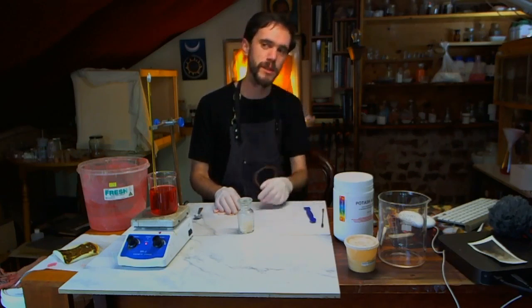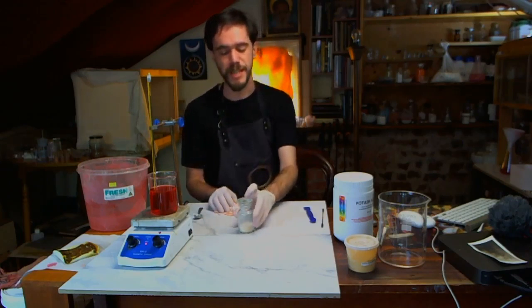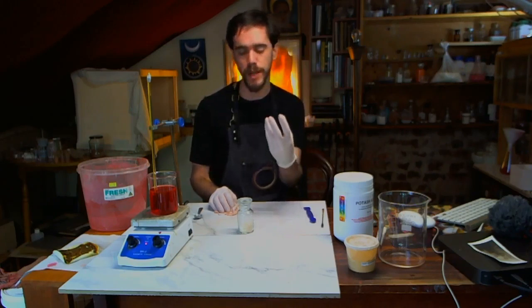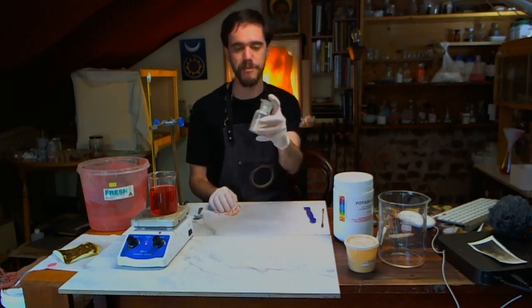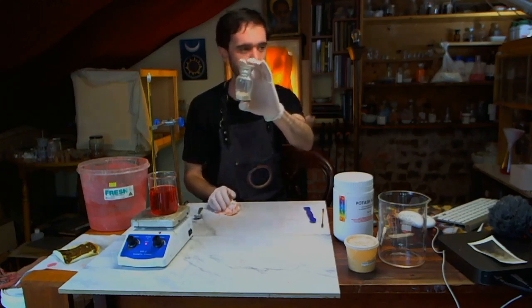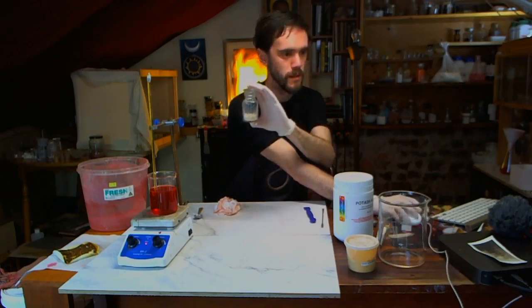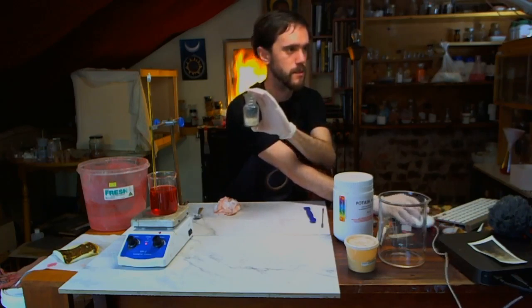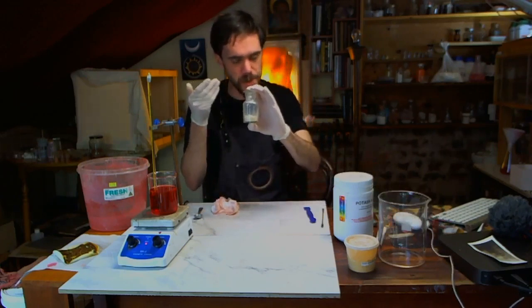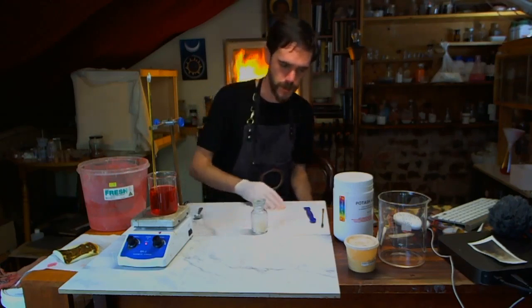I may have diluted the acid a little bit. I may have even used vinegar. I can't quite remember. But essentially, you just wait till all the lead is dissolved into the liquid, and then you filter the liquid and then evaporate it, and you'll get the crystals left. These aren't completely pure because it's slightly pinky in color. And it still smells a little bit like acetic acid, but that's essentially what it is.